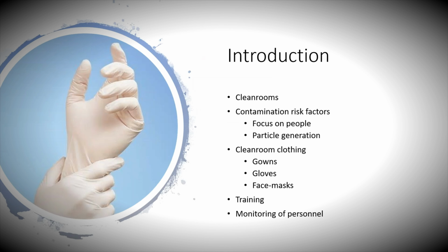a brief look at clean rooms. Then we're going to have a look at some contamination risk factors. And we're going to focus particularly on people and sources of particle generation. Then we shall proceed to look at clean room clothing, gowns, gloves and face masks, some of the important training aspects, and we'll complete with the monitoring of personnel.